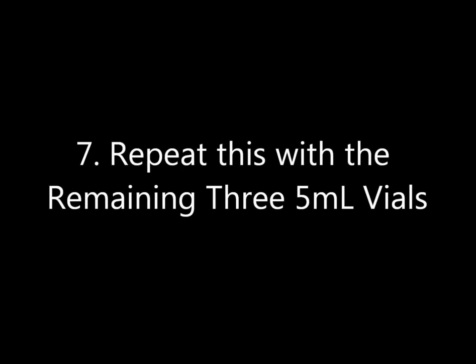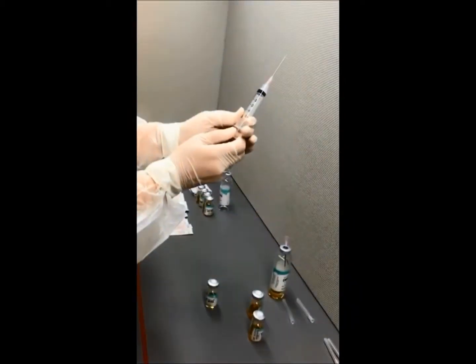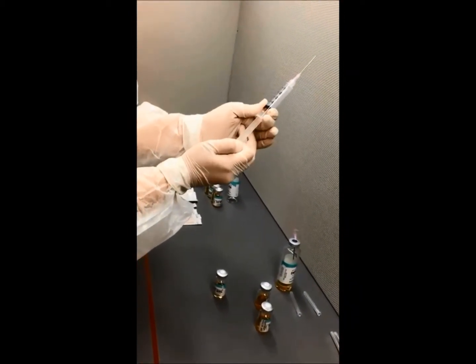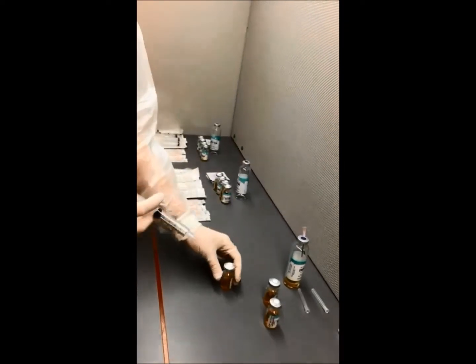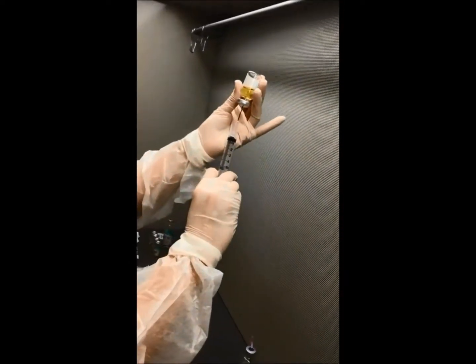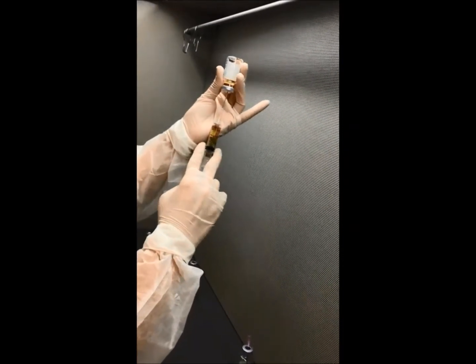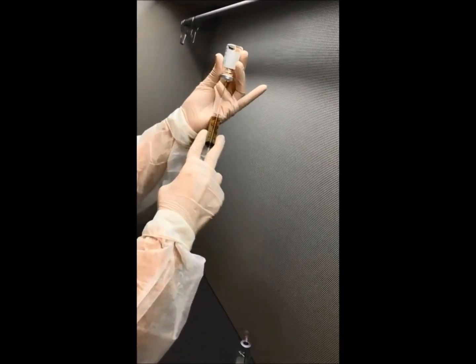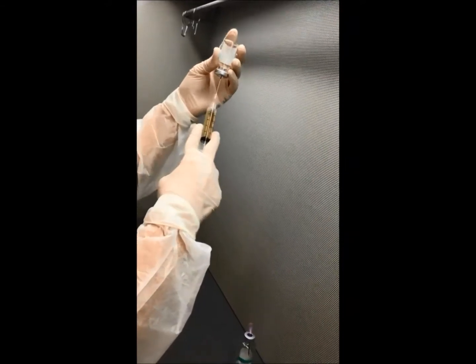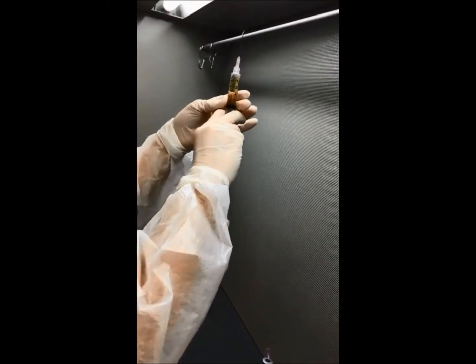Number seven: repeat this with the remaining three 5ml vials, transferring the content to the large 50ml vial.